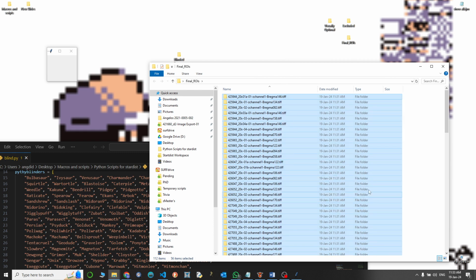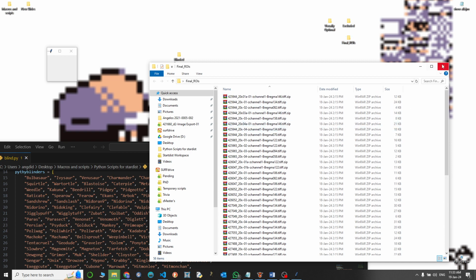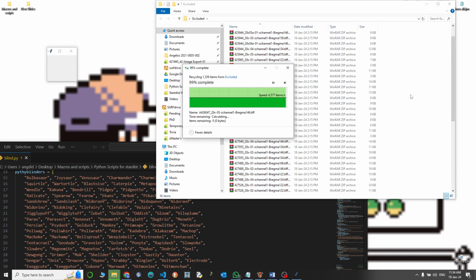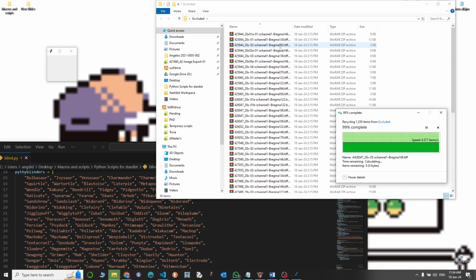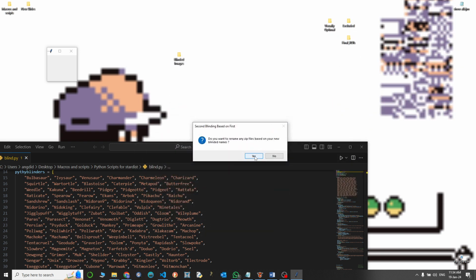Well, doesn't really matter, but just for clarity, let's just make it a bit more understandable. Okay, there's a delay in deleting the files, but it's fine. And let's also do that. Careful not to grab any zip files. Now, because I have some files that I've removed from my database, you will see that my files that have a bregma lower than 1, like this one and this one, will not be translated and blinded, but that's just because I selected to. You'll see what I mean in a while.